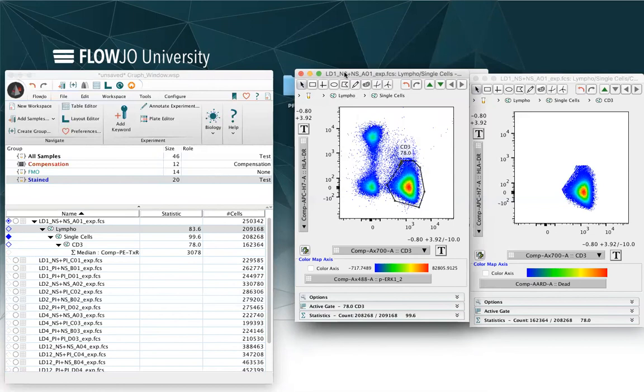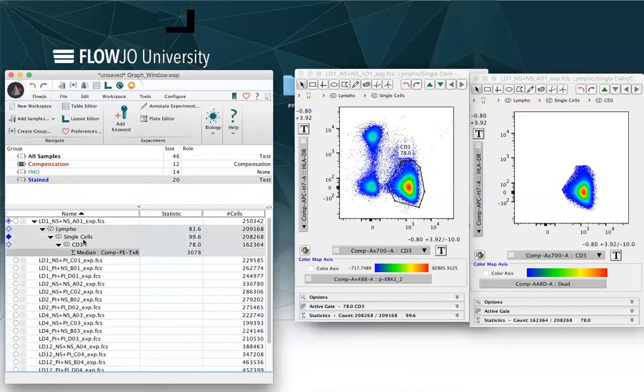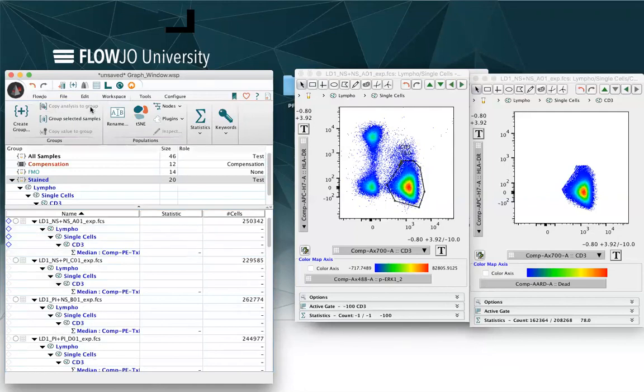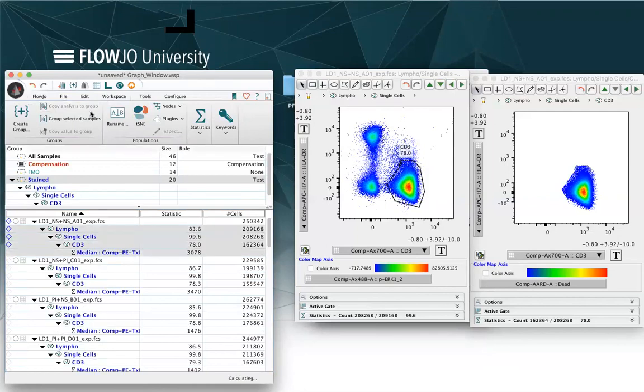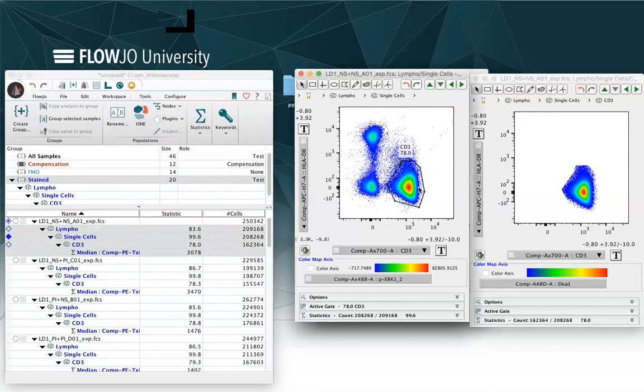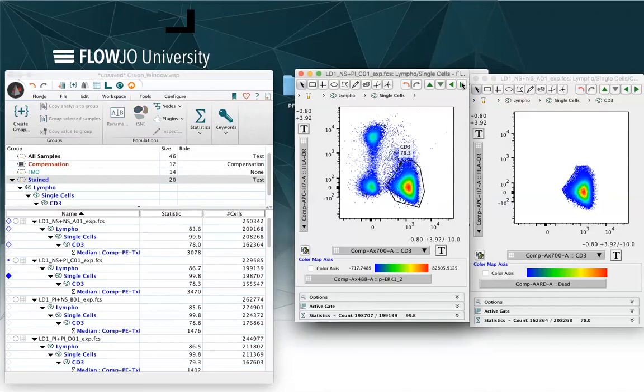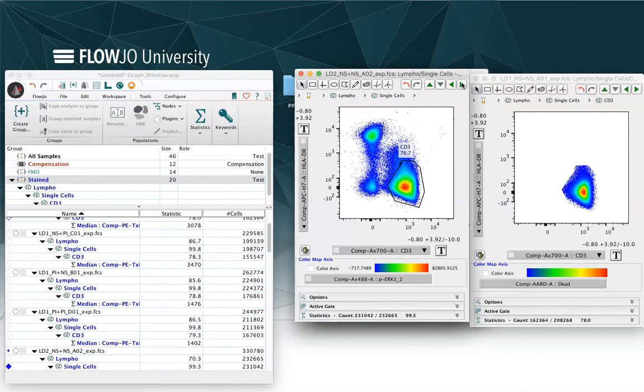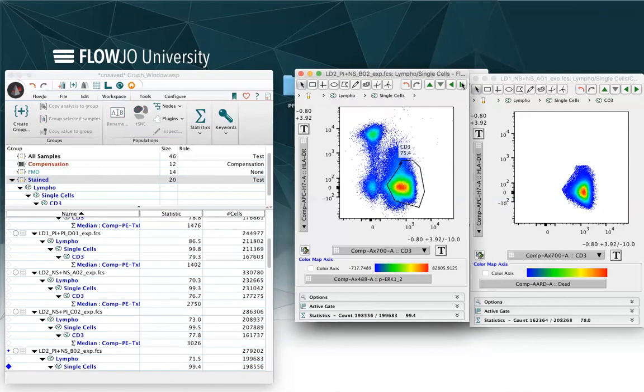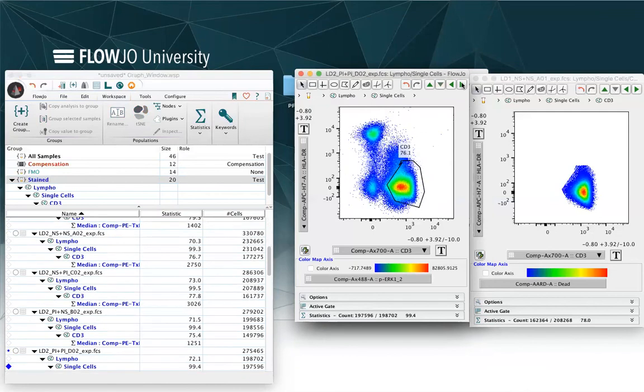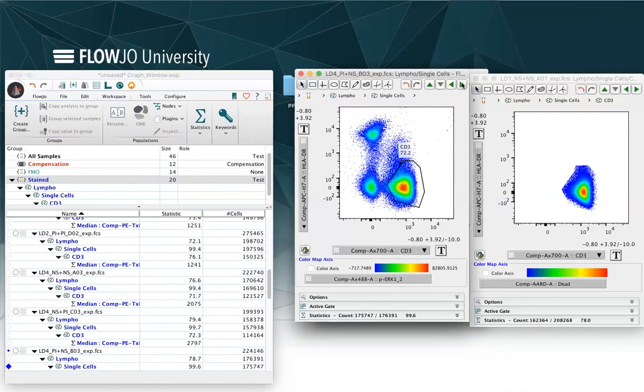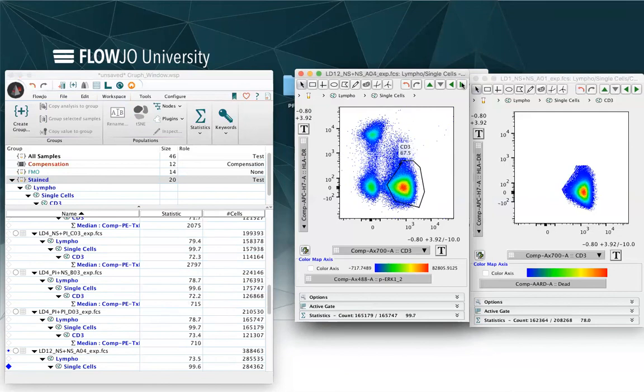If you want to apply a gating strategy to the entire group, you can select the entire gating strategy and all the gates and then click on workspace and copy analysis to group. This way, when all the samples will have the same gate, you can then navigate through the samples and look at the different gates.